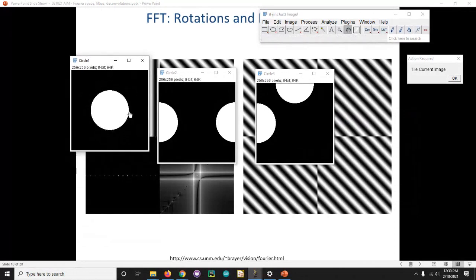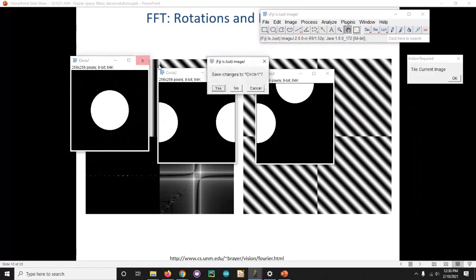That's the case sometimes in your imaging where you might not see an edge effect: if you have something in the center of your field, but all the edges are dark, then you might not see the edge effect. But most of the time, your images will run all the way up to the edge, and therefore you'll see those 2 lines in your Fourier transform. The general rule of thumb is just you ignore those. They're an artifact of the fact that the image is a periodic function.